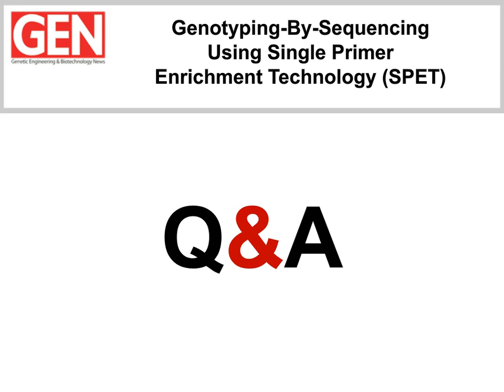No, I'm done. Okay, so we have another question for you. Is the lab process longer than with traditional hybridization-based systems? No, actually, based on our experience, we found this procedure much faster than hybridization-based, as you don't need to wait for a long hybridization procedure. Instead, you just need to follow the primer extension procedure, which is the main extra step compared to a traditional DNA library preparation.